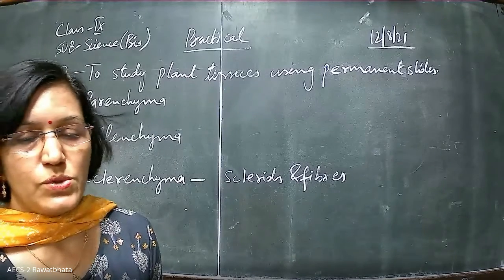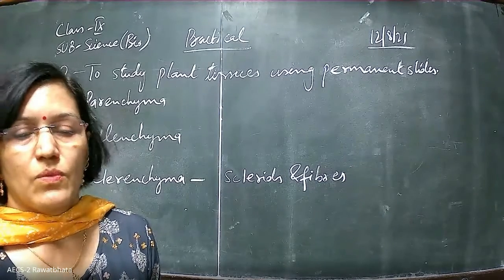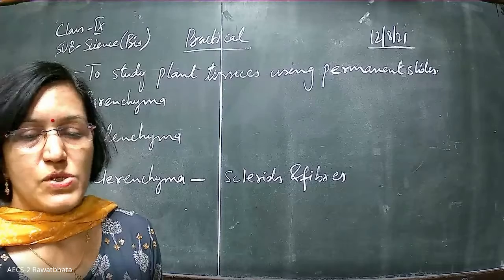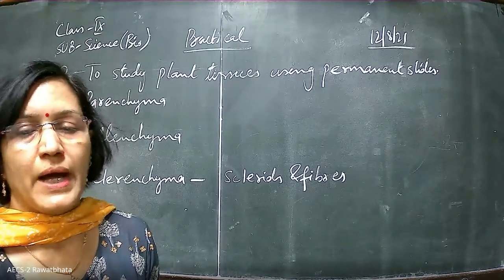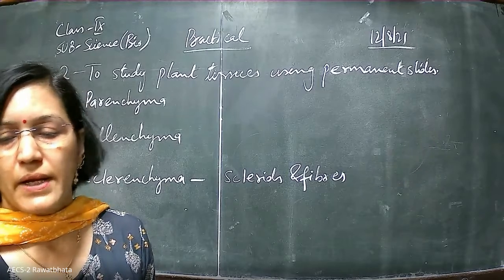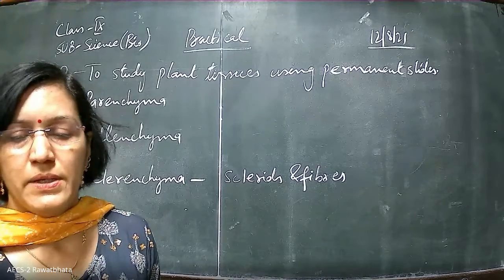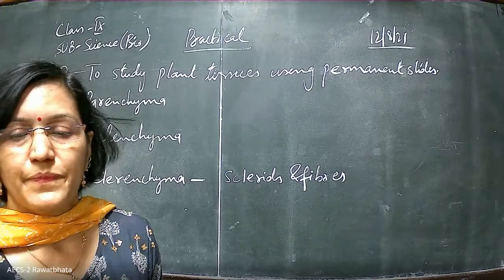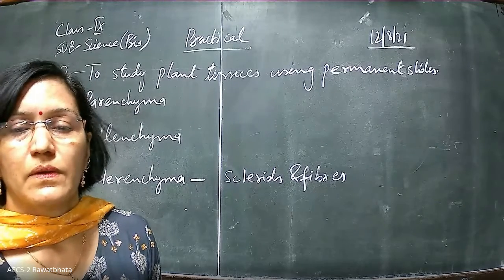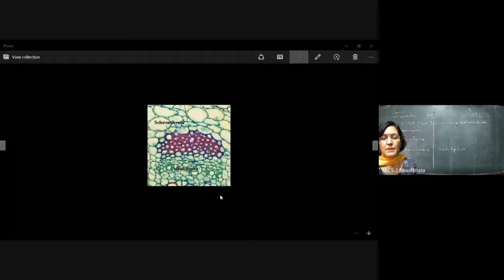Now we are going to take up one more, which is going to make the confusion clear between collenchyma and sclerenchyma. Let's see. And this is how collenchyma and sclerenchyma are going to appear to us.